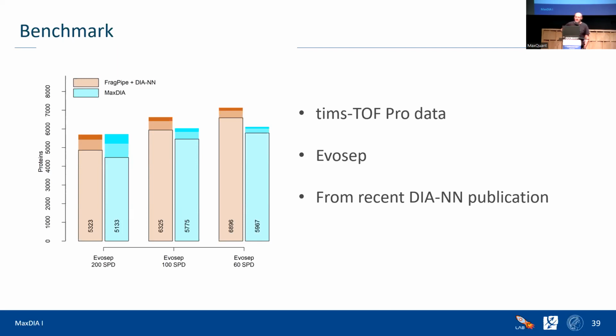So the paper only has a comparison to Spectronaut, right? So there's no MaxQuant, and I don't remember which Spectronaut version they picked, but I only remember that it was twice as good or something like this. And since we are almost as good, one can use transitivity, I guess, to infer that we are better than Spectronaut.